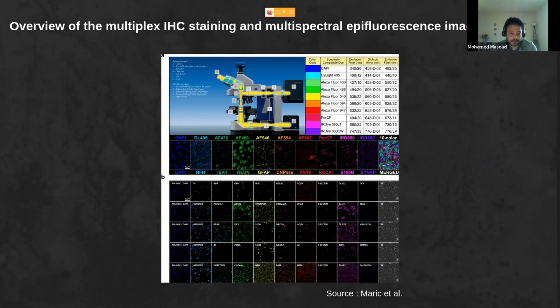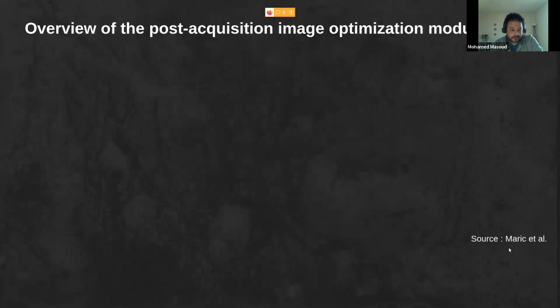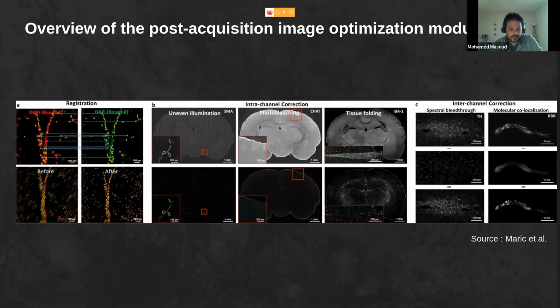So the part after this image acquisition deals mainly with correction.